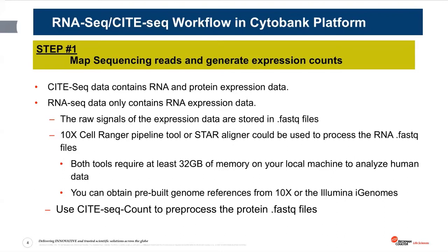If you cannot easily find bioinformaticians, at Cytobank we also have a data consulting service team, which I'm part of. And we can help you to process and analyze the data for you. And just in the real world, very often bioinformaticians would not do the map alignment process on a small desktop machine, and they will usually use Linux clusters or open a virtual machine on AWS or Google Cloud to use a big virtual machine to process this data set.